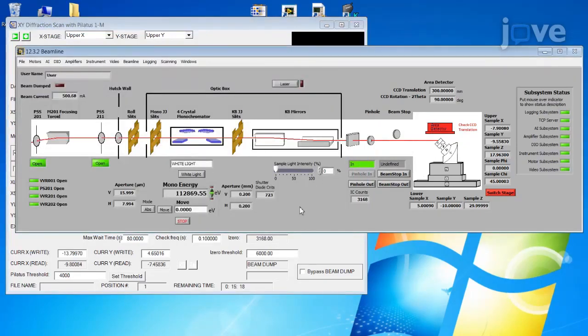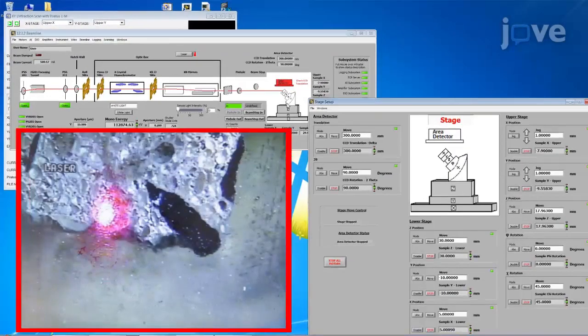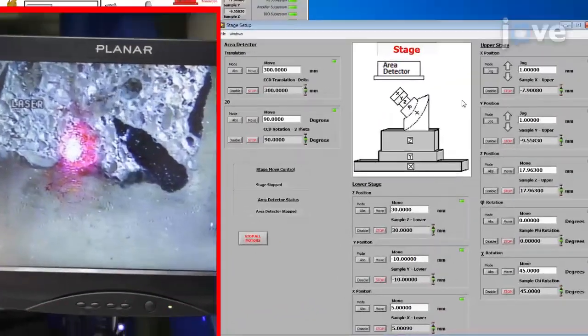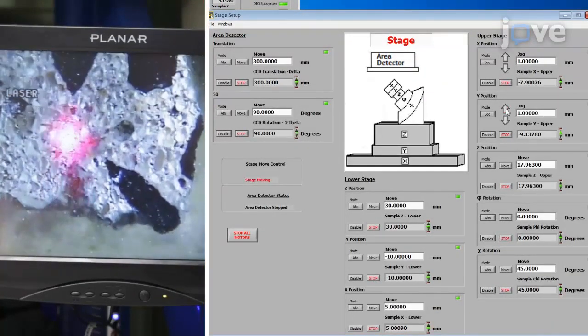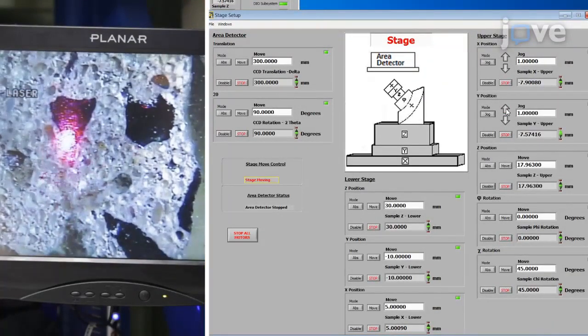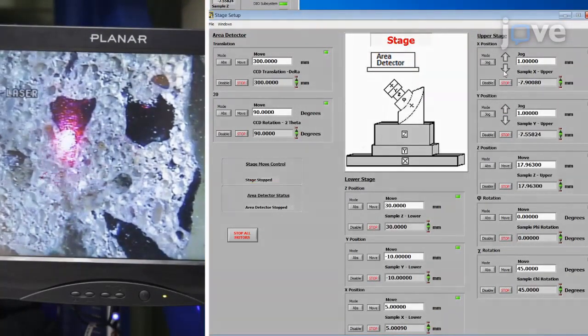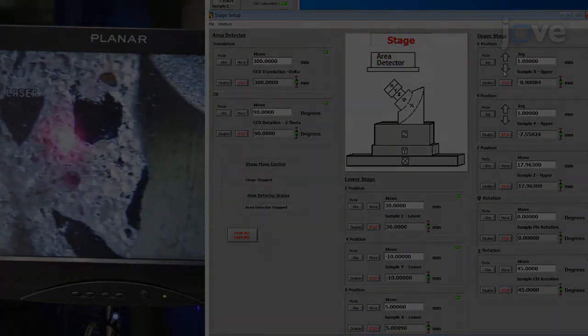Then turn on the alignment laser and open the stage setup menu. Translate the sample stage so that the sample region of interest is within approximate visual focus of the rough alignment camera.